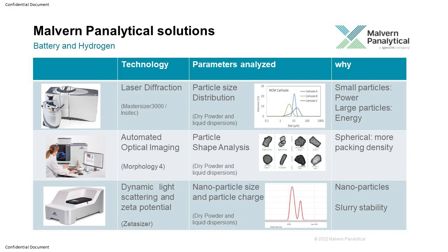Usually in battery chemistry, spherical particles are desired because spherical particles give you more packing density. Any deviation from spherical particles will lead to inhomogeneous coating as well as less energy density. So people want to have spherical particles. Even for graphite, although graphite has a very long C-axis and naturally does not exist as spherical particles, they agglomerate many particles to make a spherical particle to get better properties.